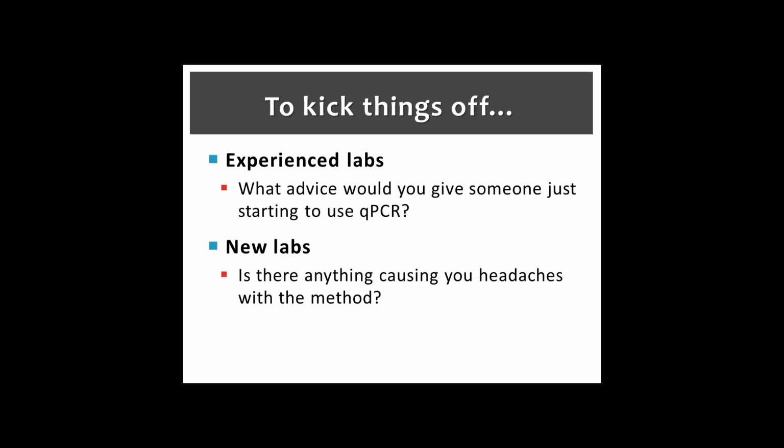So, I mean, you think it should be pretty simple, like 10 milliliters to the liter or something like that. But especially the salmon DNA can be notorious for having troubles reproducibly diluting it. But if you're working with the same stock, it's always good. So just a little tip. Thank you. Any other questions?